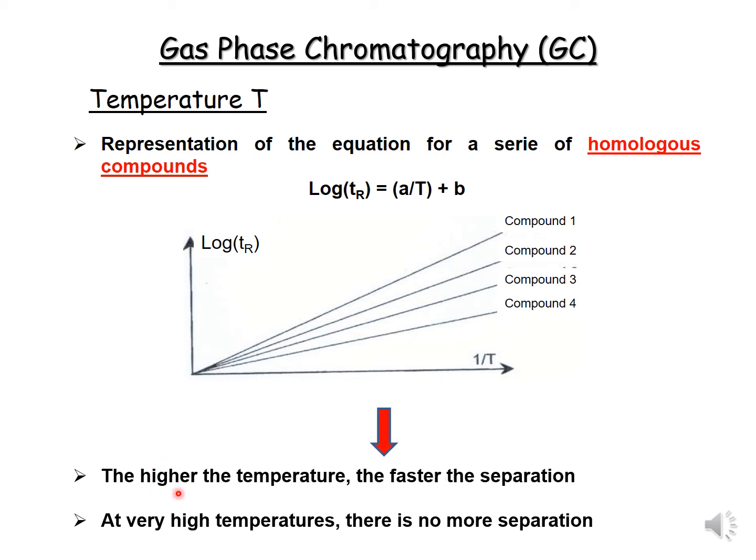That's very important. If I increase the temperature, I decrease the retention time. At very high temperature, there is no more separation. In that case, it is impossible to have a difference in the retention time, and then it is impossible to separate the compounds.